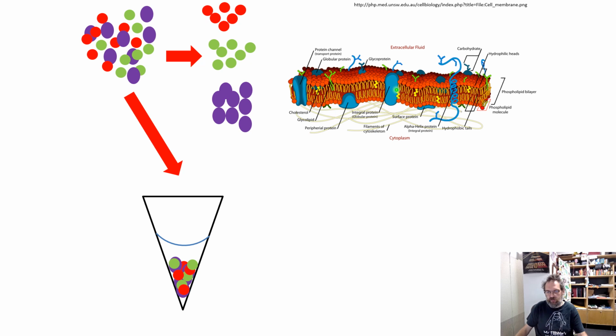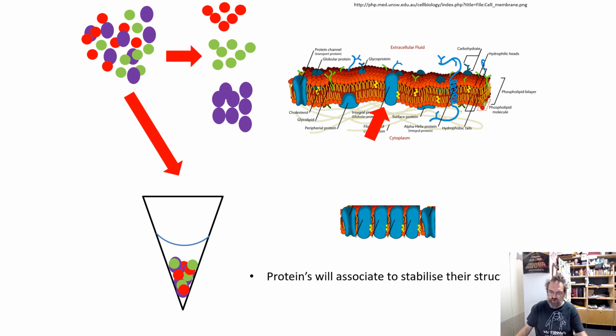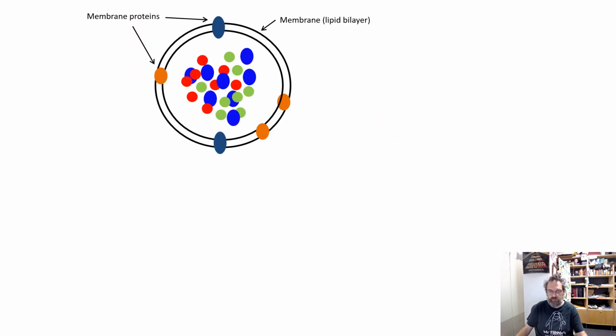Within the membrane, these things are not able to be separated effectively. You need to get them out of the membrane. So, isolate them as these monomers, somehow get them suspended in liquid. Now, these are hydrophobic molecules. They don't want to be suspended in liquid. So you've got to actually add something to them to help them stay in the liquid, rather than have them aggregate and precipitate where you can't get them.